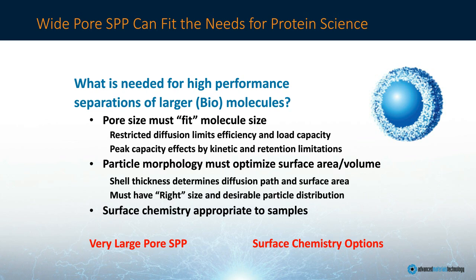So the shell thickness must be tailored to the right size so that the diffusion path and the surface area are respected as well for favorable separations of these larger biomolecules. And particle distribution is important, as well as the surface chemistry on these particles.